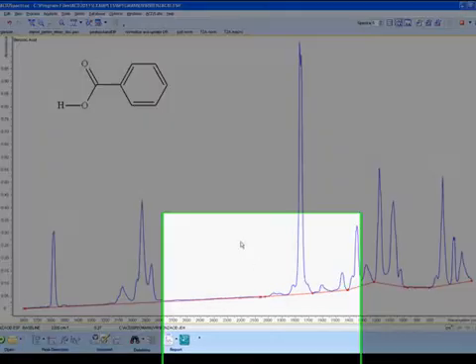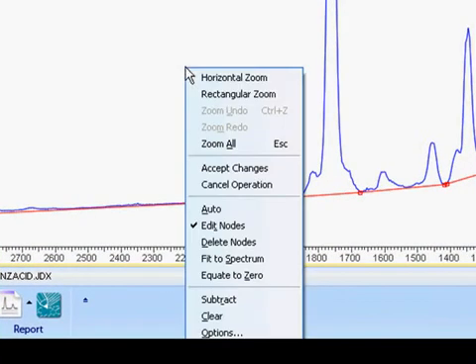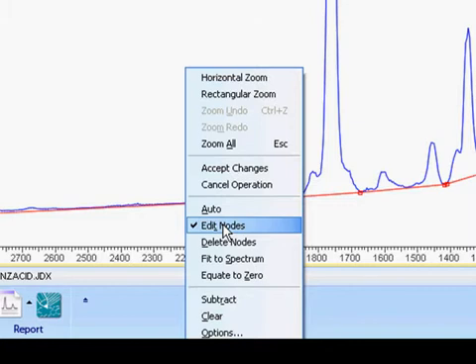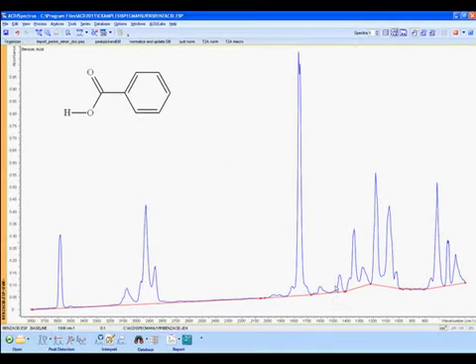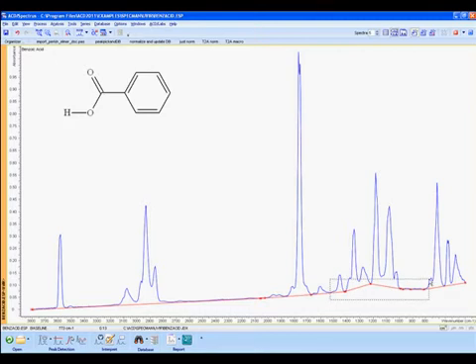We've seen how to add nodes, and we can remove them as well. Right-click and you'll see we're currently set to Edit Nodes. Click on Delete Nodes to enter that setting, and simply click and drag a selection box to remove all the nodes in that area.